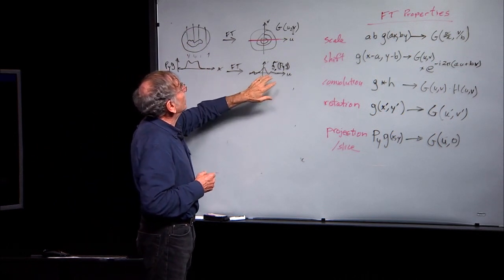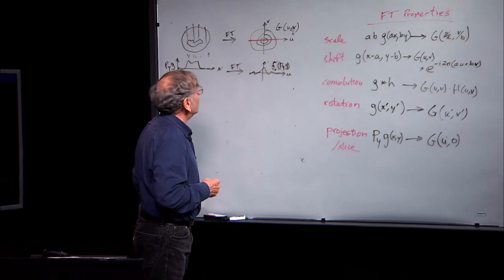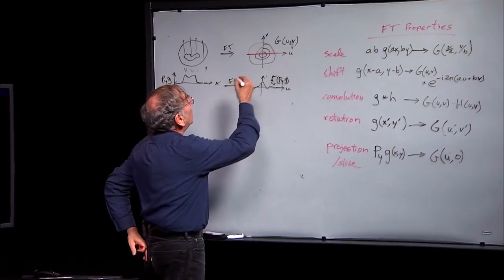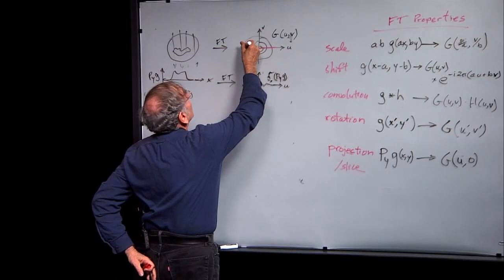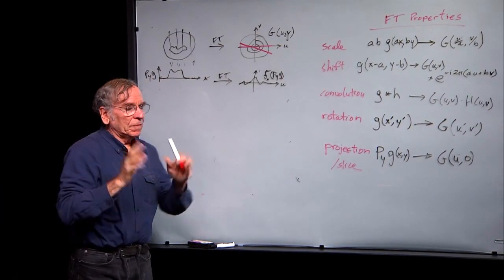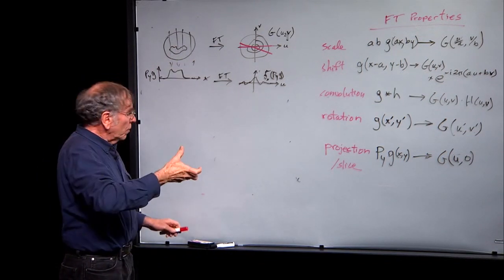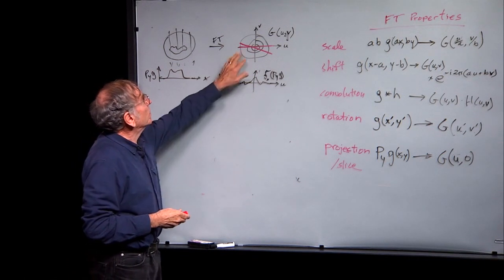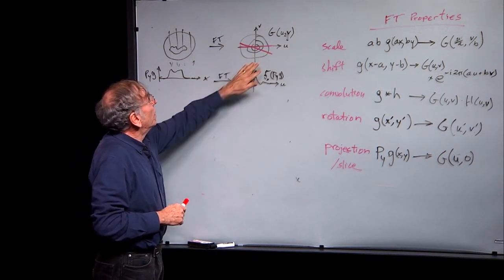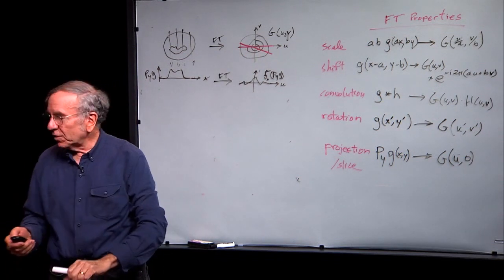We get this 1D Fourier transform, but we now know that we've rotated the Fourier transform. And so if we were to insert the new slice, the slice would be at a different angle, which represents the angle by which we rotated everything. And so if we rotate through all possible angles, we actually have a way to fill in all possible pixels in that two-dimensional distribution.